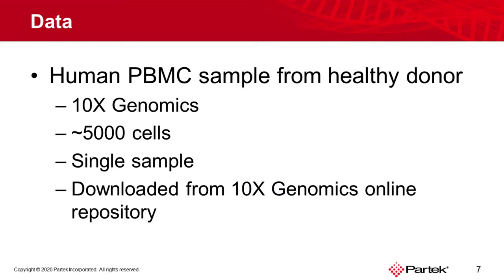The dataset I'll be using to demonstrate these features is a human PBMC sample from a healthy donor. This is a 10x Genomics dataset, although we support single-cell data from any platform. Roughly 5,000 cells were screened in this sample. These were cells from a single individual, although we do support multiple samples as well. I got this data by downloading it from the 10x Genomics online repository.